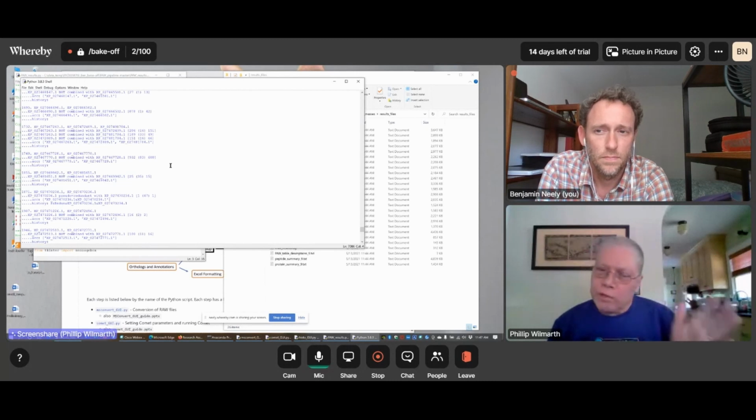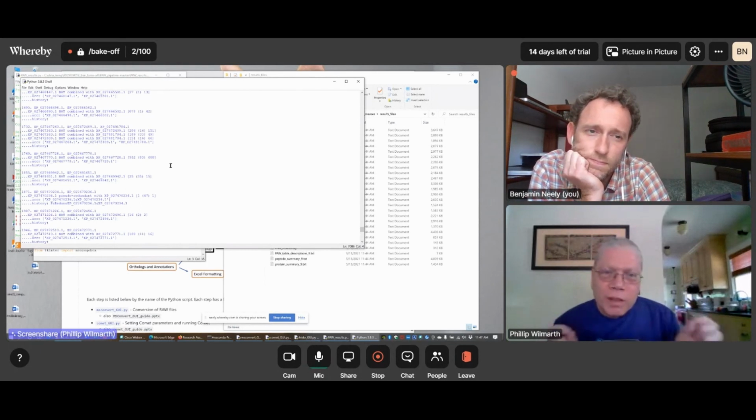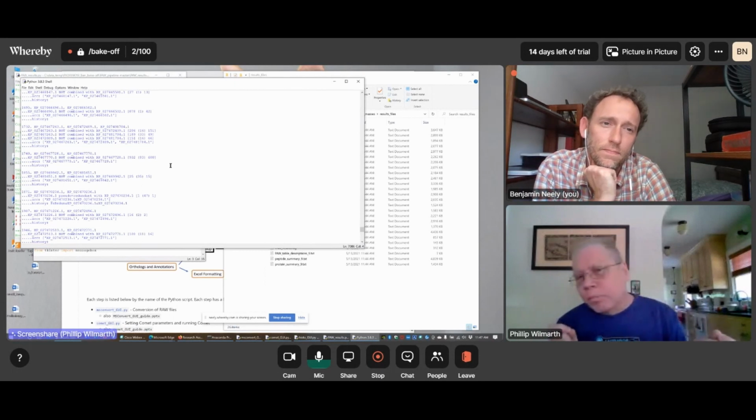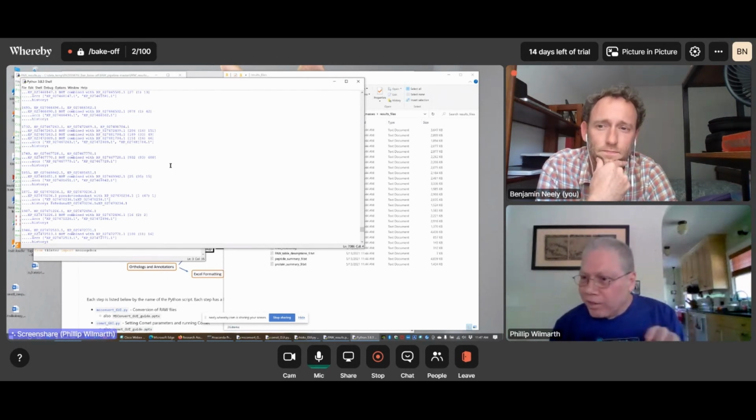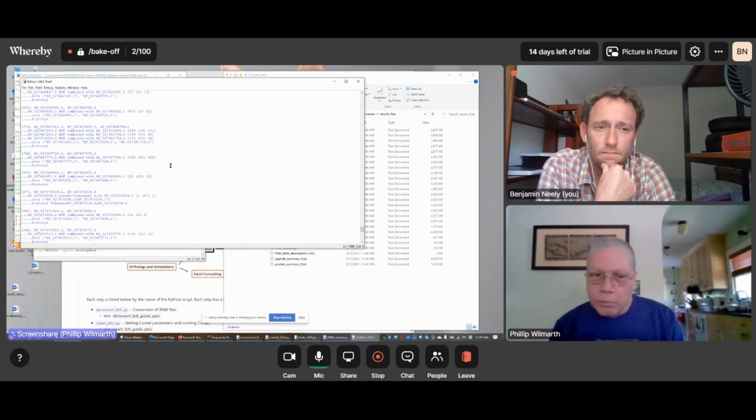A lot of those proteins are going to fall together in groups and not have distinguishing peptides. But sometimes they just have a teeny bit of distinguishing evidence, but it may be very minor compared to the total amount of evidence for those proteins. And we know that we don't have a 0% error rate in our PSMs, and these are big data sets. So those additional odd matches to a protein could be incorrect matches. So maybe we don't want to rely on just a single peptide, when we've got a bunch of shared peptides associated with 2 proteins, as sufficient evidence to distinguish them.